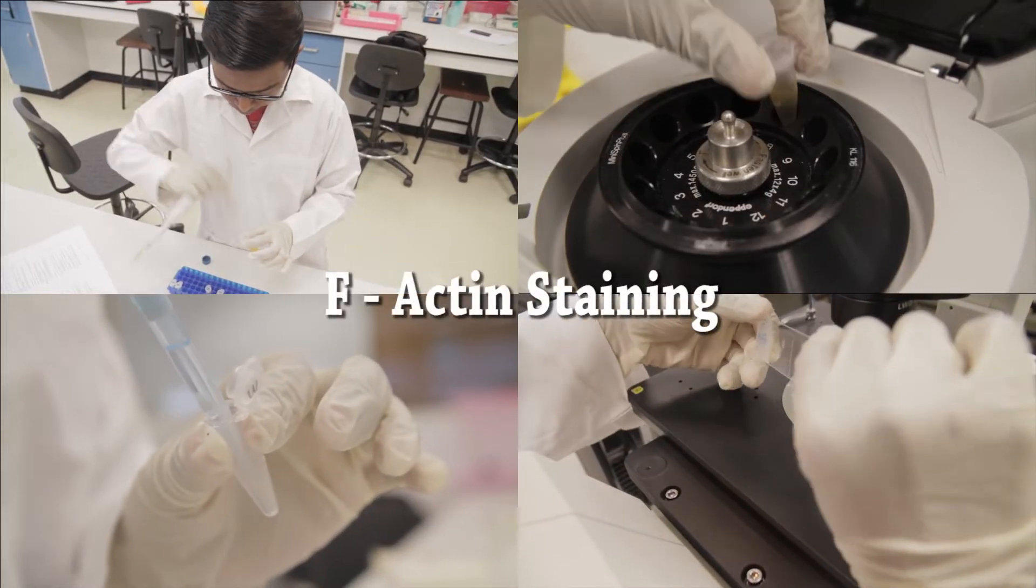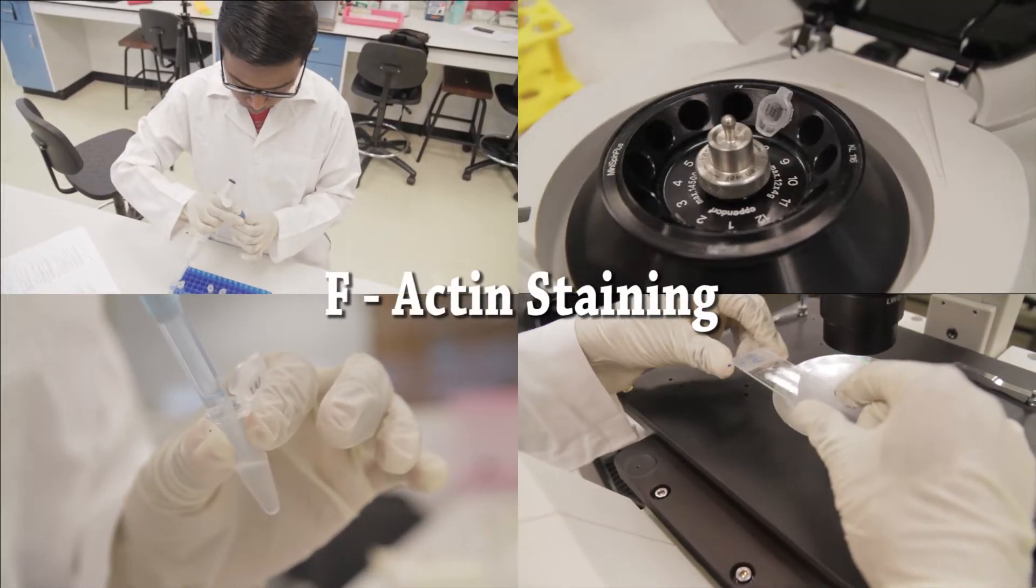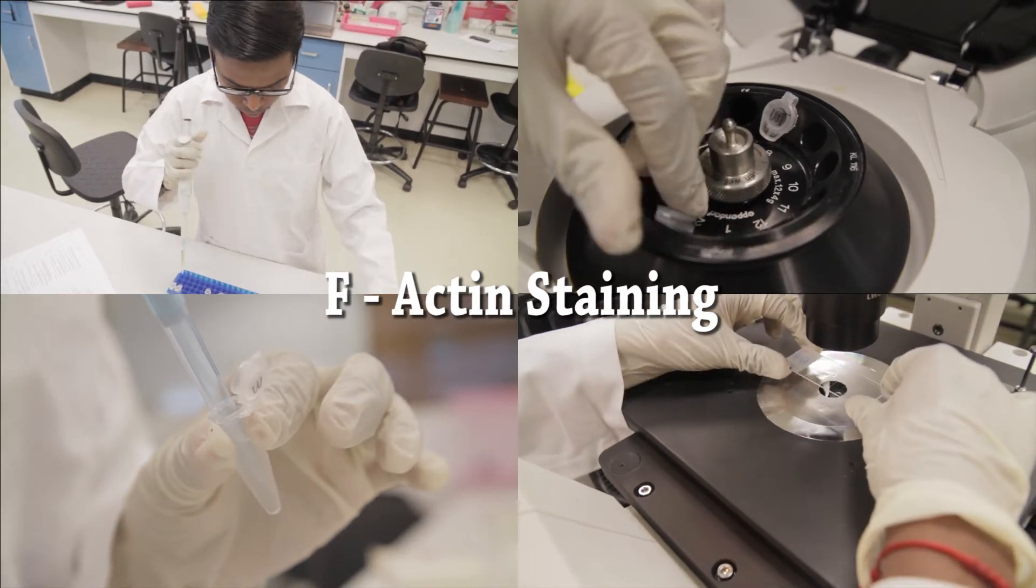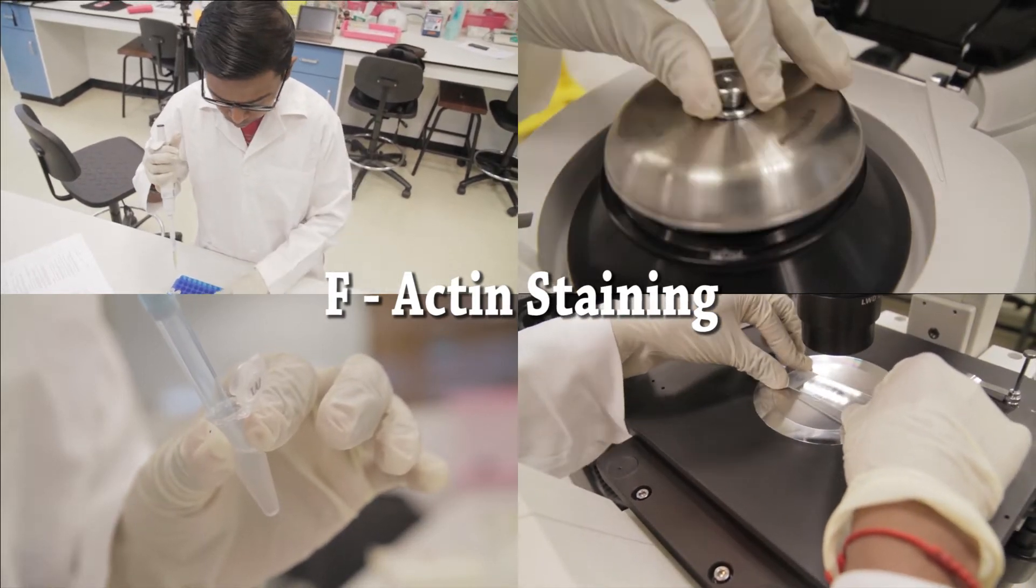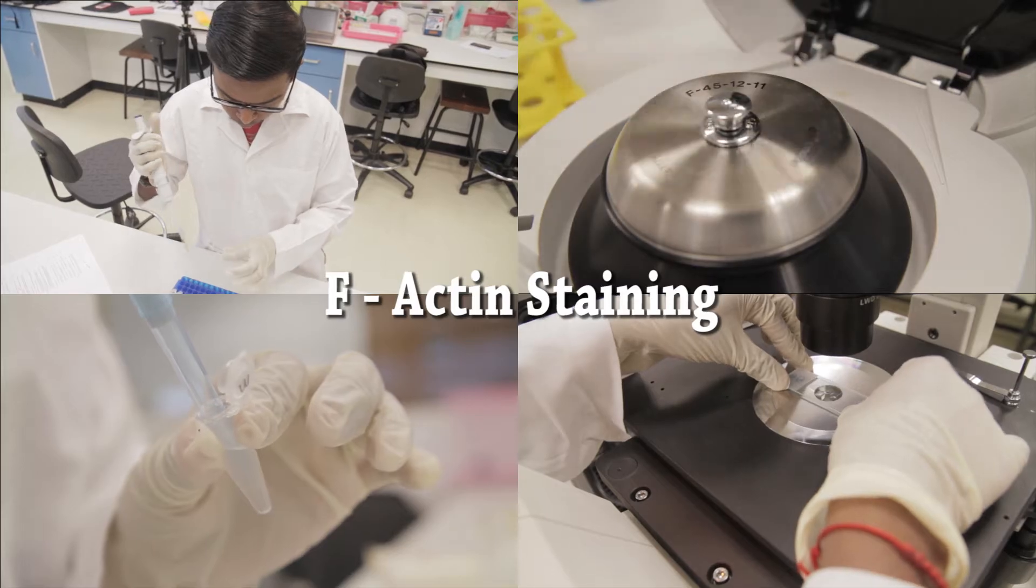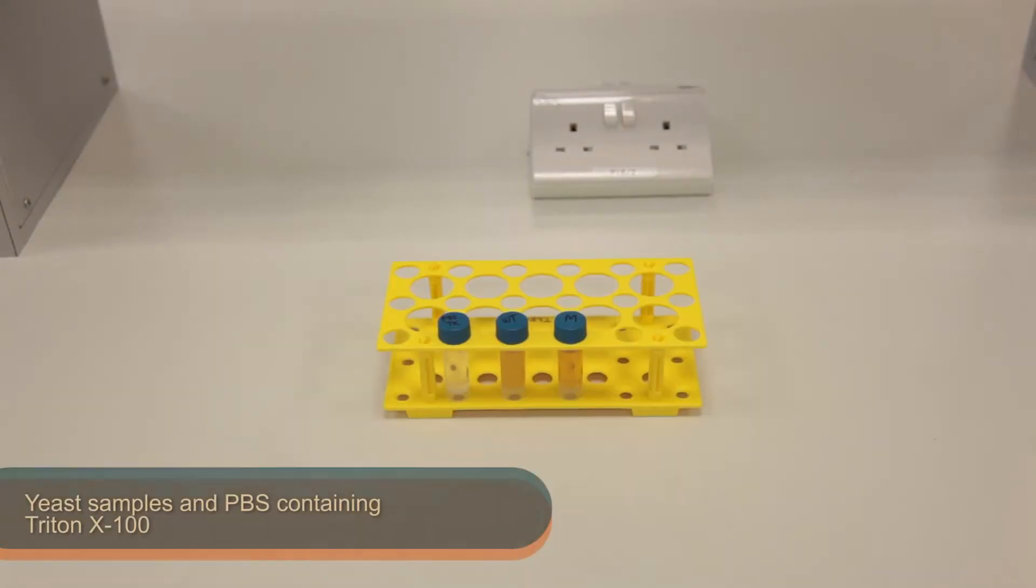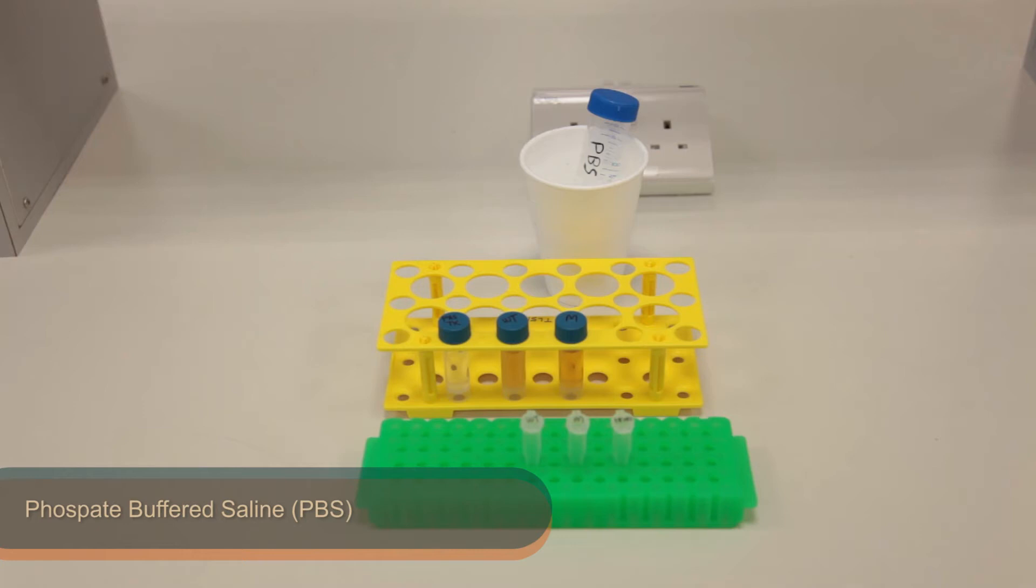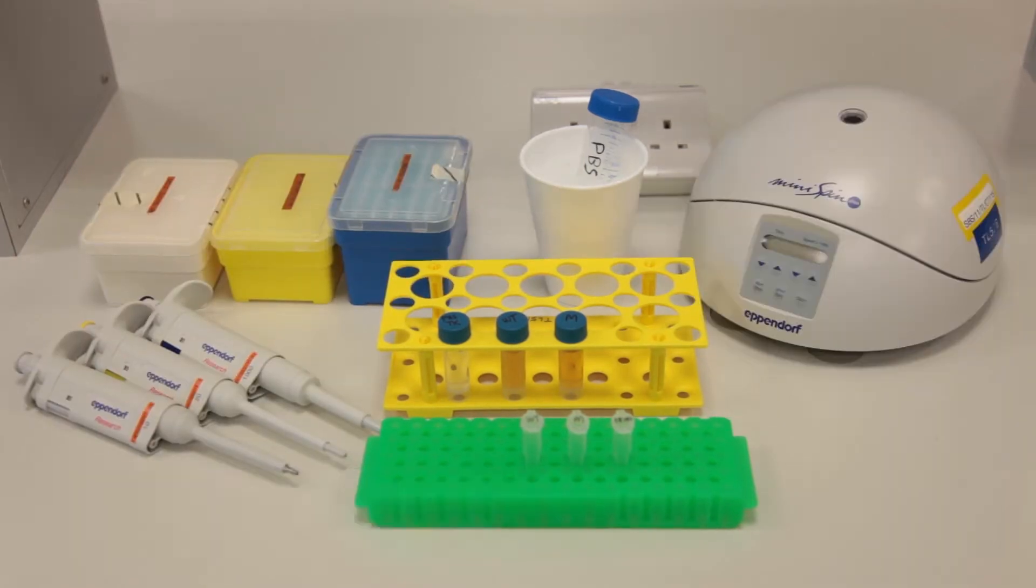In part 2 of this series, we will be carrying out an F-actin staining. F-actin is important in many cellular processes such as cell signaling and cell division. These are the reagents and equipment needed. Do check if you have everything before you start.